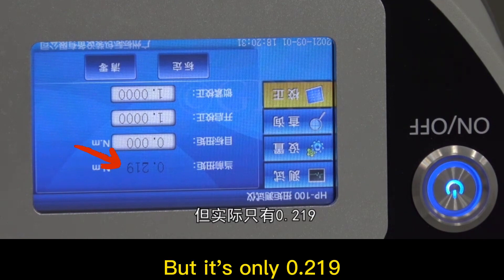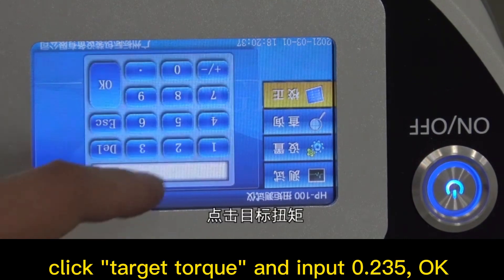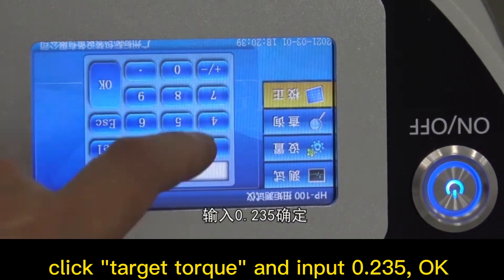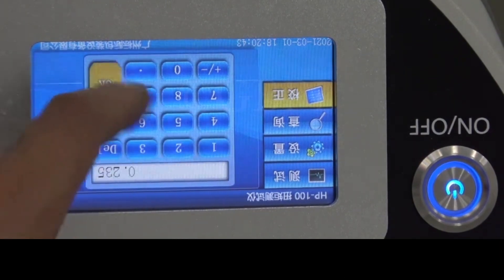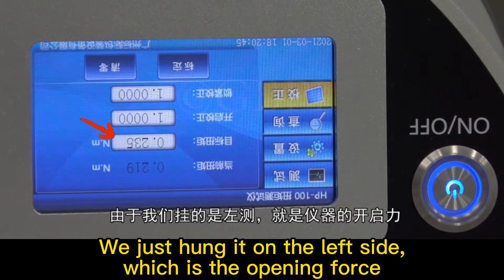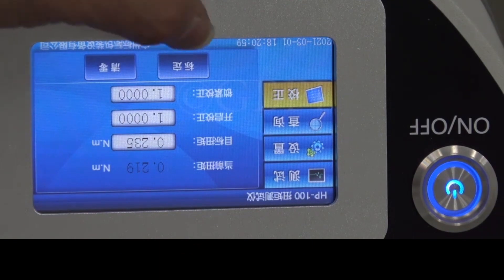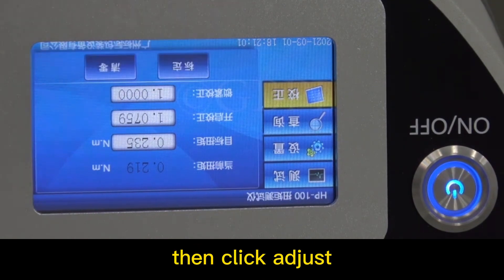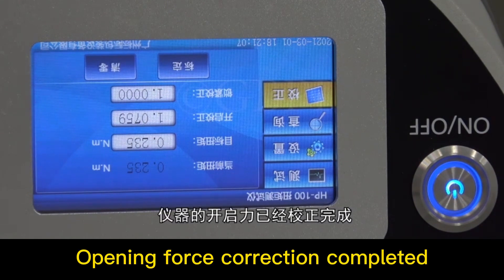The gravity value should be 0.235, but it's only 0.219. Click target torque and input 0.235, then click OK. We just put it on the left side, which is the opening force. Then click adjust. Opening force correction completed.